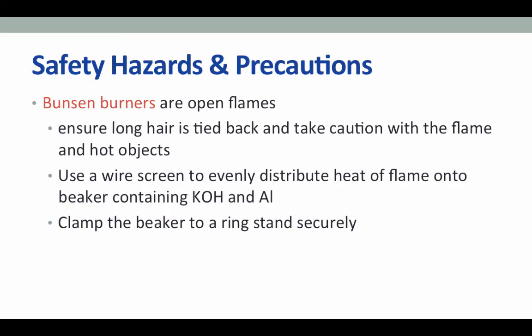Also, never leave your flame unattended. If you need to get a new piece of equipment or supply, send your lab partner to get it while you take care of the flame. Otherwise, turn off the flame to fetch the needed objects.